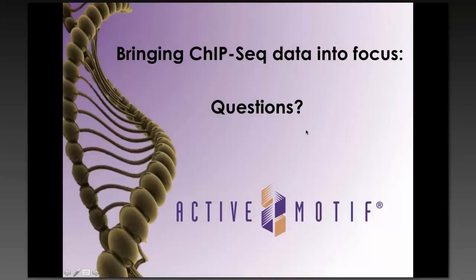Do you see a reduction in DNA yield after ChIPing for H3K27, meaning reduced DNA yield in the presence of EZH2 inhibitor? They're asking if there's less DNA coming out of the ChIP reaction, less when you use the inhibitor versus when you don't. Yes, so we quantified the amount of DNA coming out using a Qubit, and we do see less ChIP DNA coming out of the reaction. It's very much in line with what we're seeing by Western blot and the results we've seen by the ChIP-Seq.